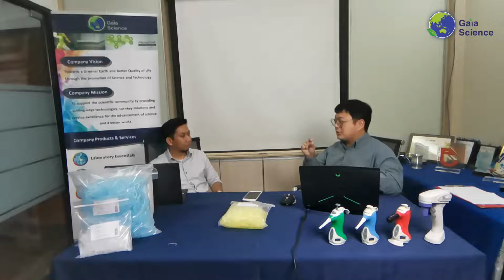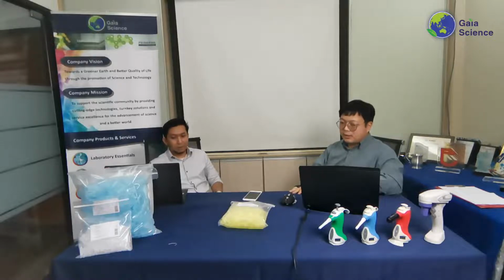Where you need precision, like I was saying just now about the other categories of tips, sterile and non-sterile ones, any small amount of foreign contaminant or foreign objects can affect the results. So with DNA, RNA, and protein, where high precision is required, low retention is actually important at that level.